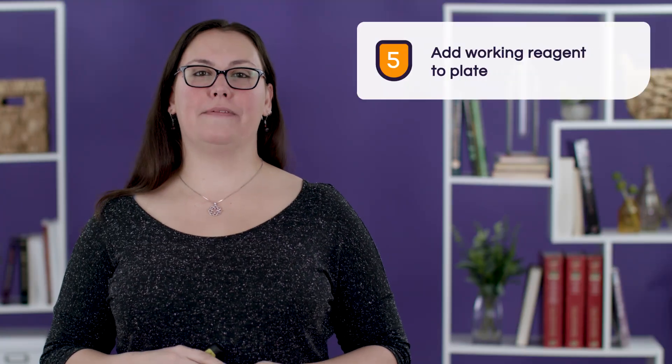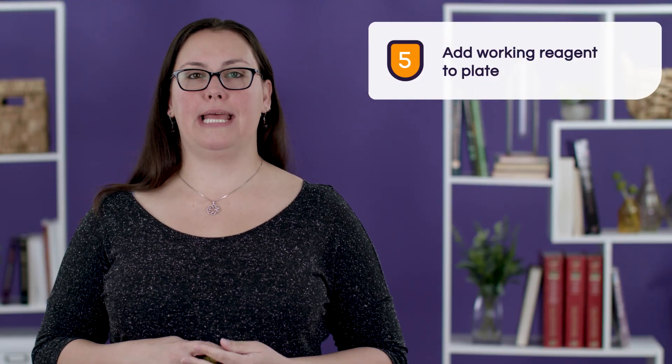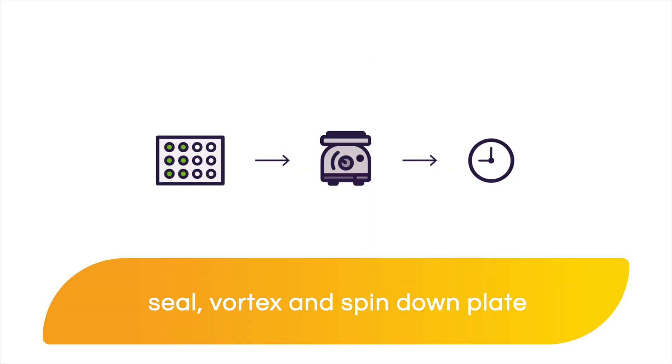Time to add the working reagent to the plate. Since this is not an endpoint assay, we recommend doing this step as fast as possible. Using a multi-channel pipette can help you accomplish this faster while you add 200 microliters of working reagent per well. Once that is done, we're going to seal the plate, gently vortex it, and spin it down for about 30 seconds.